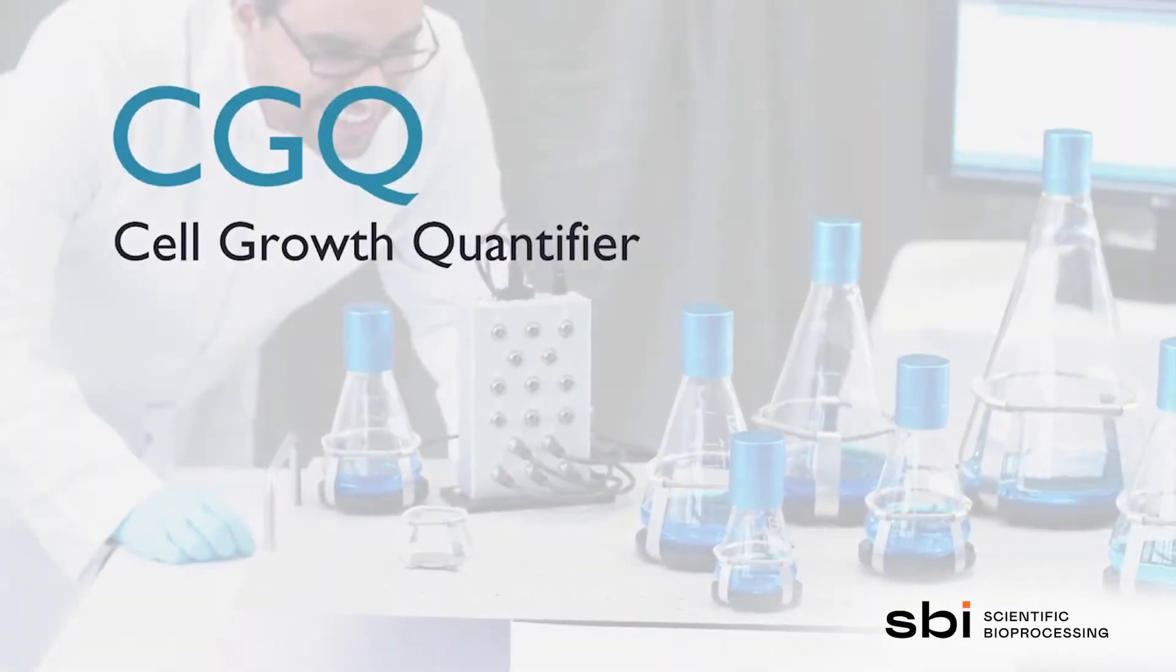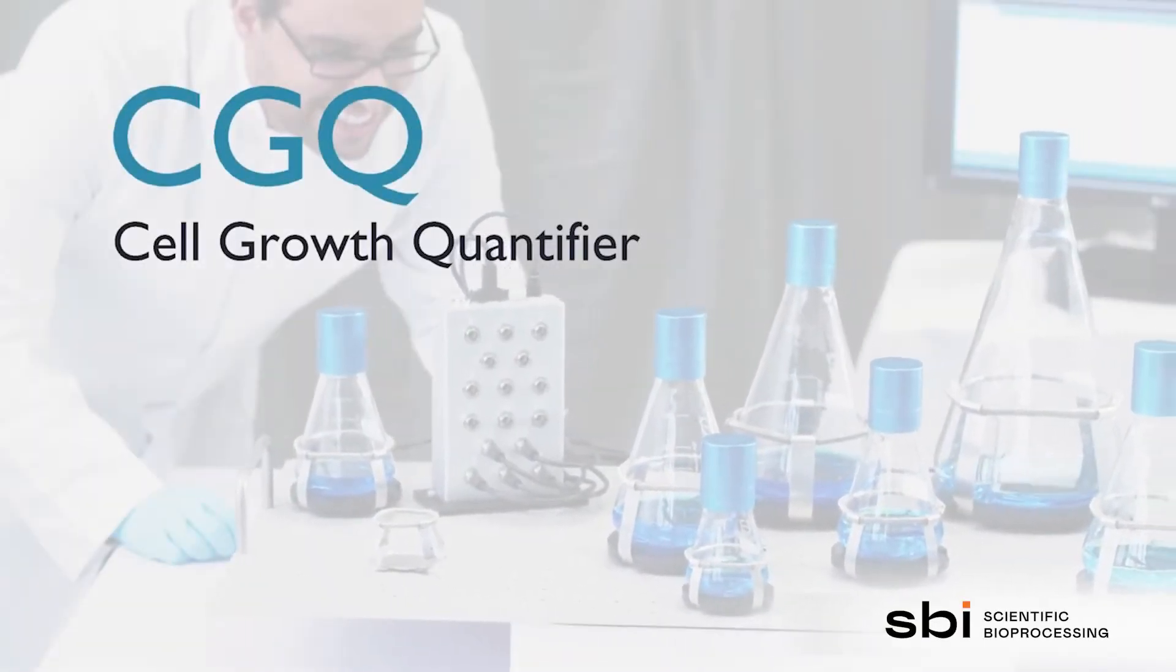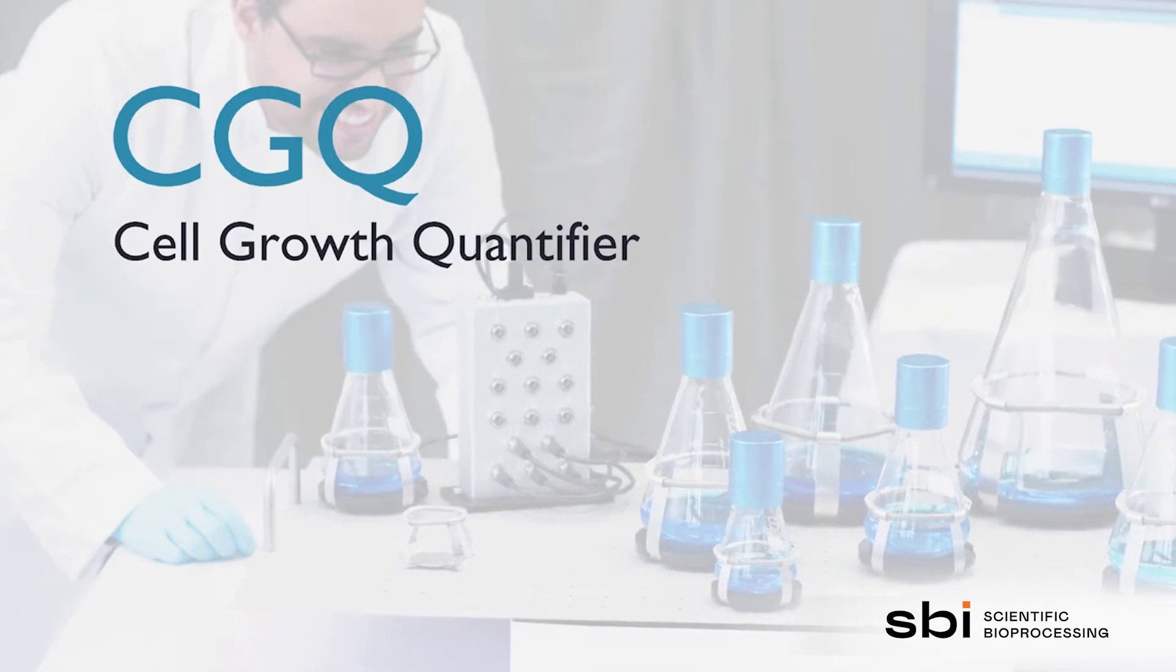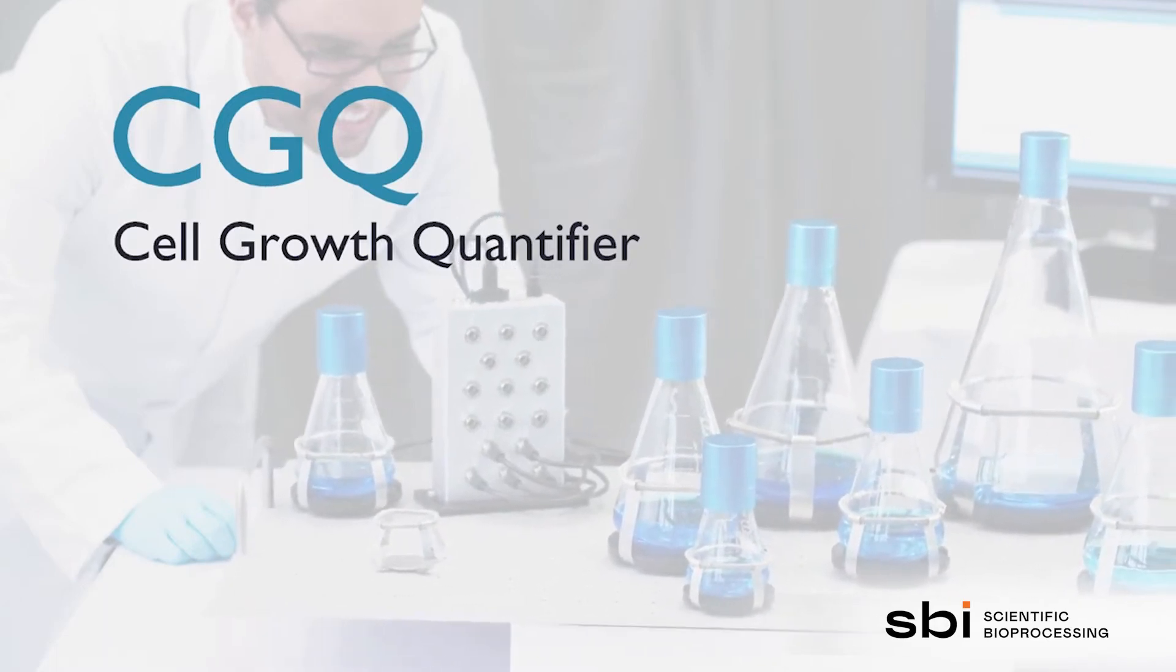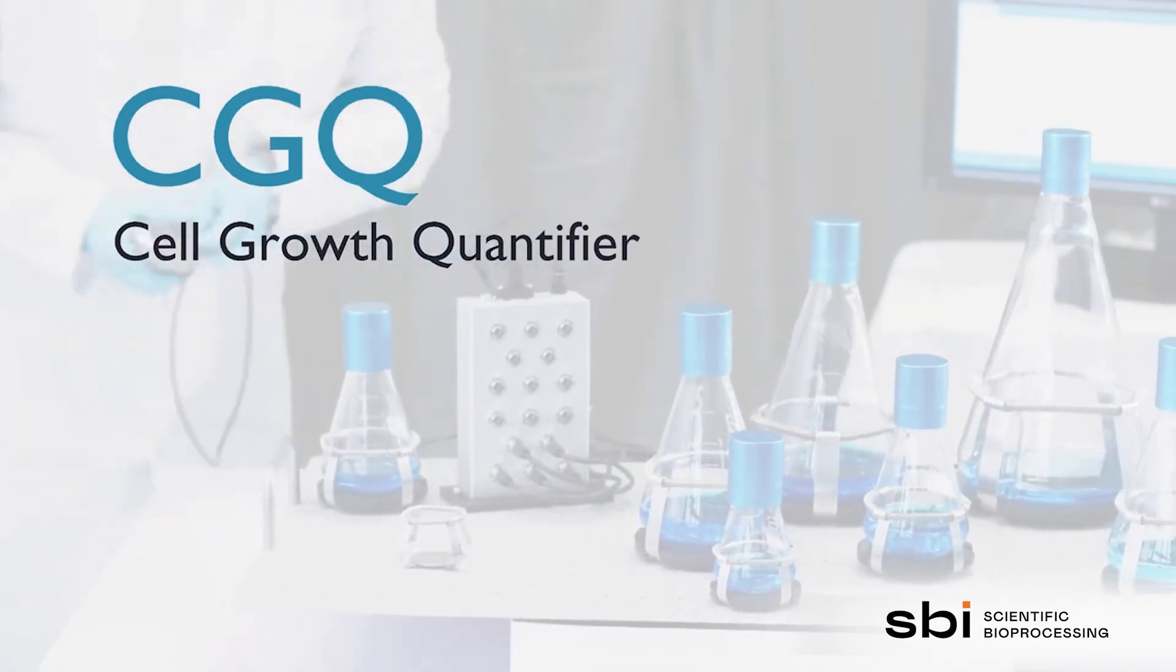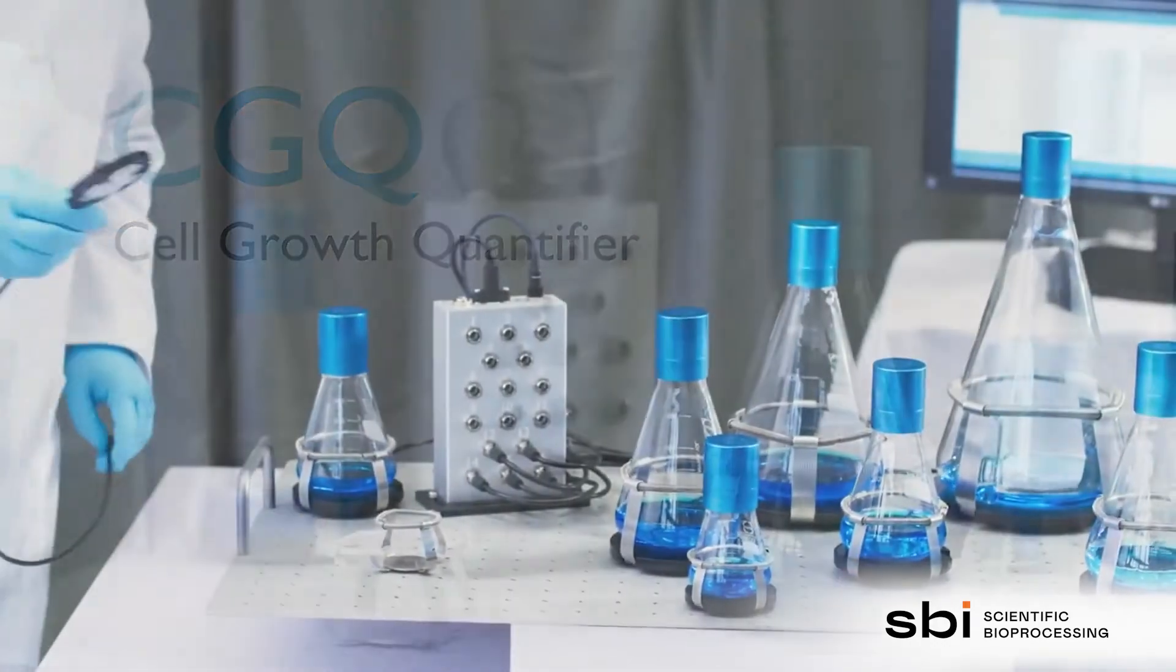The cell growth quantifier, CGQ, allows for automated and non-invasive online biomass monitoring in shake flasks, serum bottles, and other cultivation vessels.